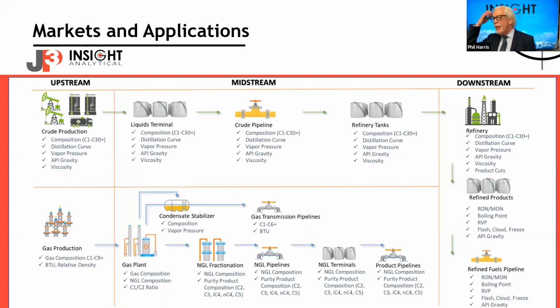Yeah, sure. I mean, again, it's going to vary a little bit on application. We're just doing a few installs right now in Canada, and typically, from pulling the first sample to, I think we're talking about validation on the next round of samples, it's probably been about 2 months. And again, that's highly variable, like we were talking about before.